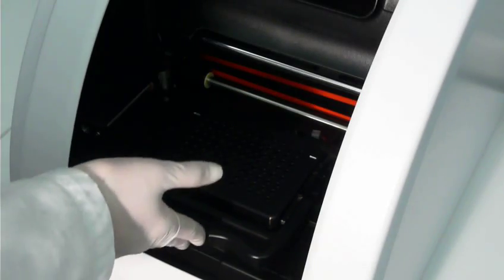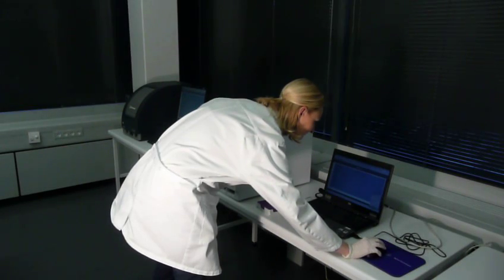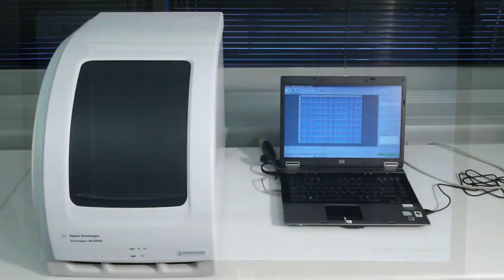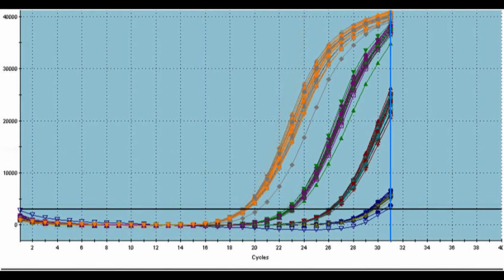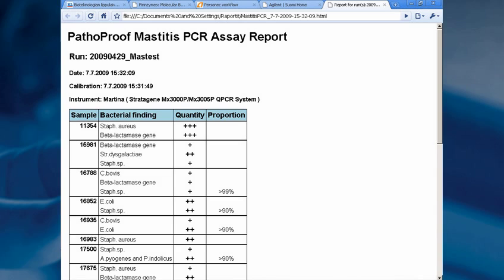The user needs only to load the samples into the instrument and start the analysis. When the PCR run is finished, the results can be easily analyzed using the Pathoproof Mastitis software. The fluorescent signal increases when the bacterial DNA is amplified, producing a characteristic curve. The software automatically creates assay reports from these curves, giving semi-quantitative results. If one bacterial species is present in over 90% of the total bacterial load, then this primary pathogen is also reported.